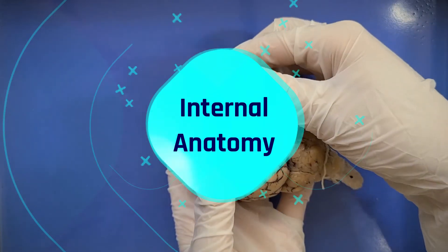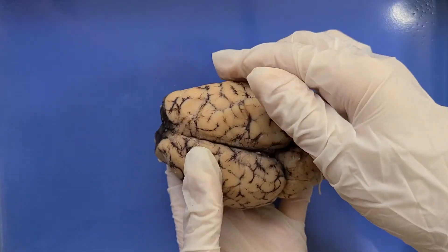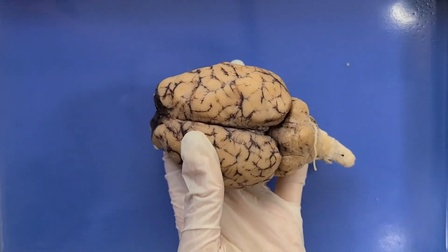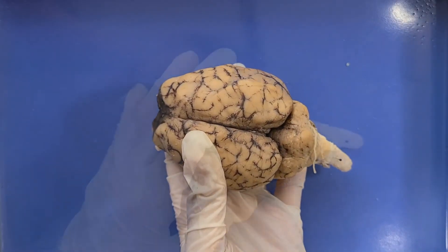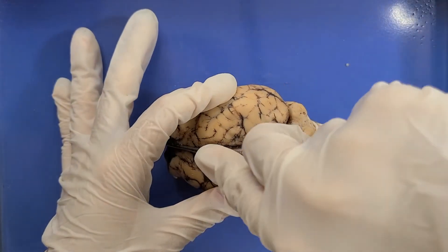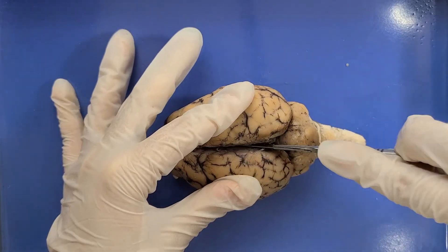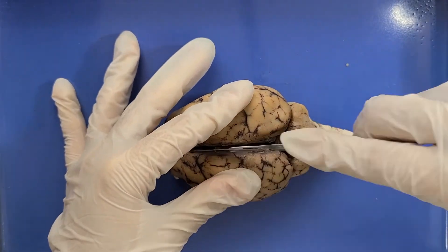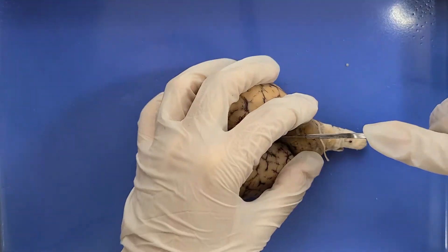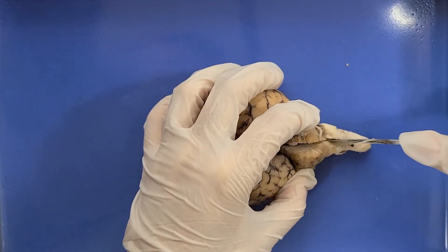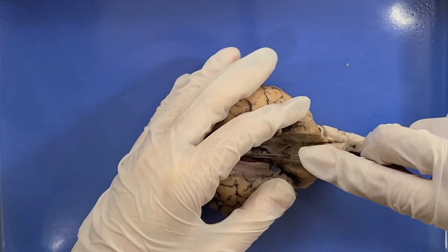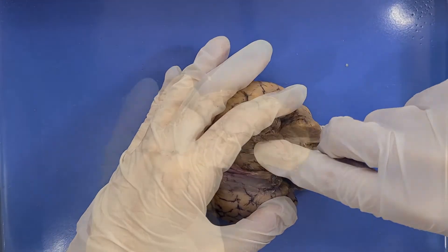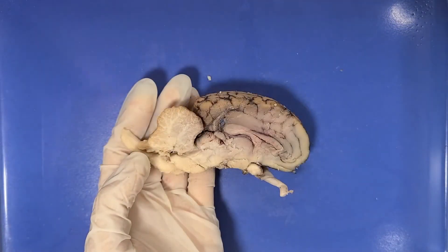Now let's look at the internal anatomy. I'm going to cut through the corpus callosum and separate the two hemispheres. I'll take a scalpel and cut gently down the center line, cutting through the cerebellum as well. Now let's look at one of the halves.